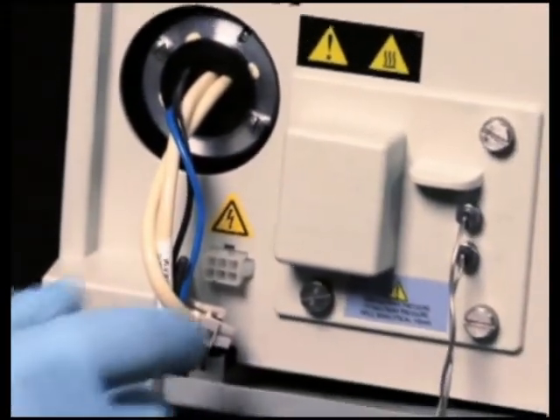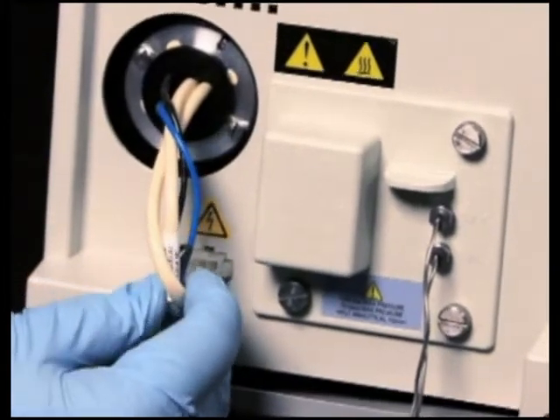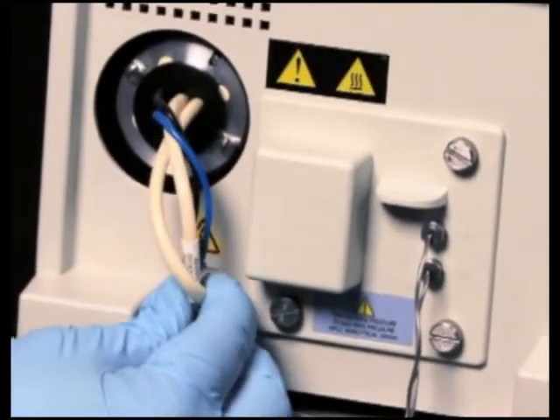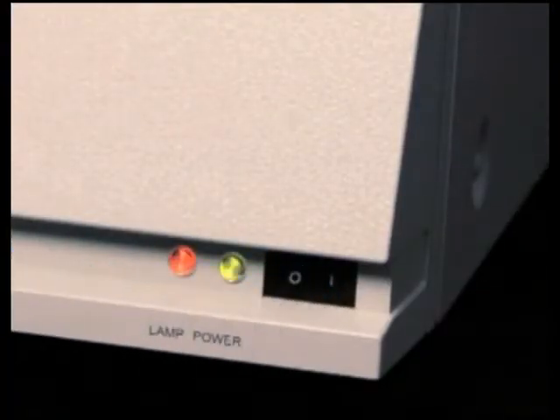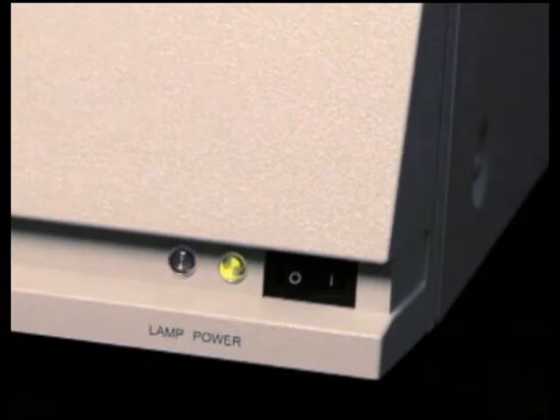Connect the lamp power connector. Reconnect the power cord and power up the detector. Upon power up, the 2998 performs internal diagnostics. When complete, both LEDs illuminate. The lamp LED indicates the new lamp is working.